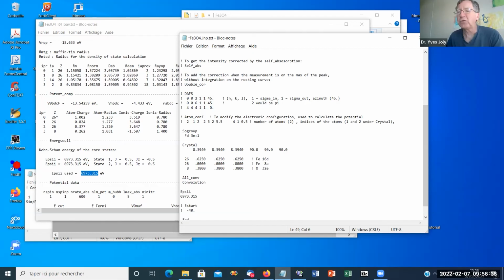So, to summarize, to compare with experiment with the best possible shift, between experiment and simulation, you always have a shift to perform at the end, but it must always be the same if you use this procedure.